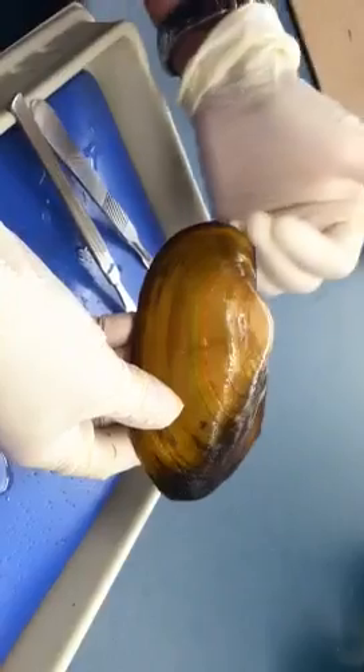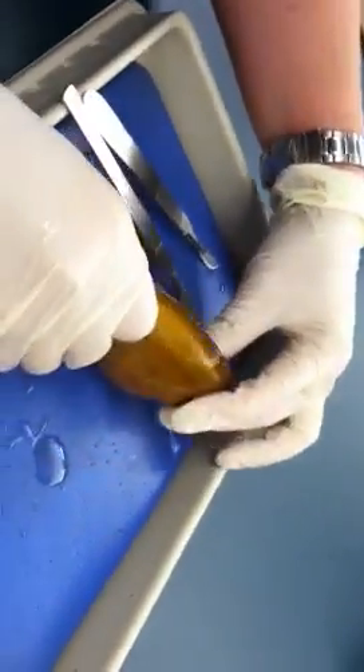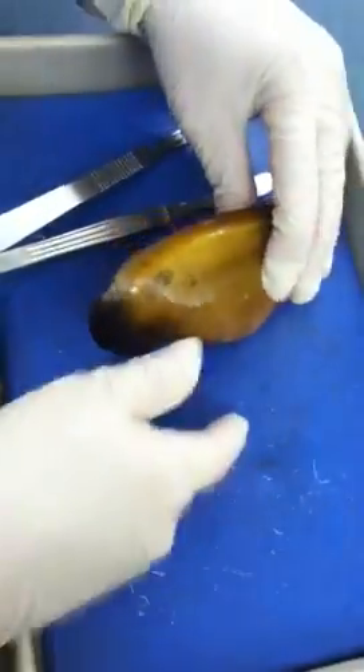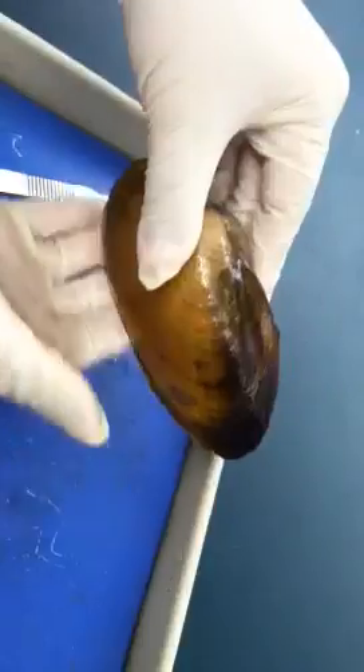After you identify anterior and posterior, now we need to determine dorsal or ventral. For the clam, originally in the ocean, they sit up on the bottom like this, so the side where the umbo is at is called dorsal, and the opposite side will be ventral.